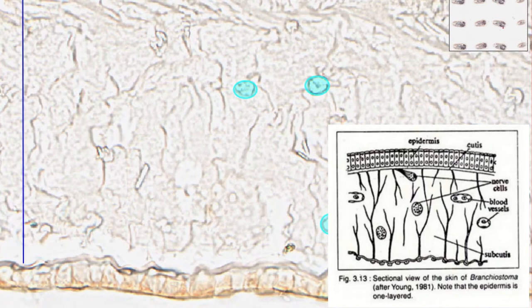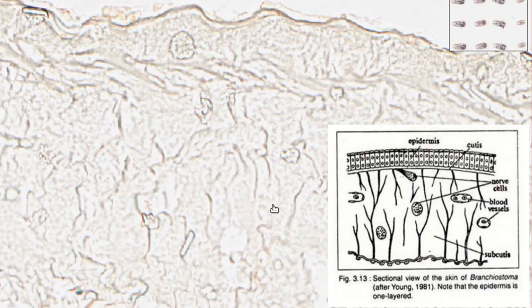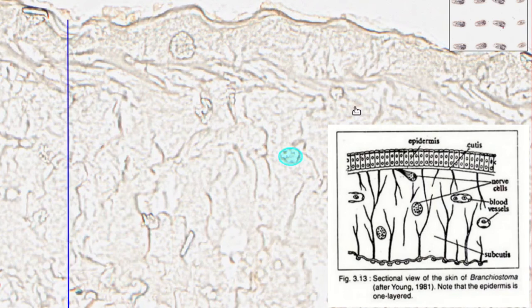So now, within the subcutis, we can start to see these kind of thin circles. I highlighted a few here. These are probably blood vessels.